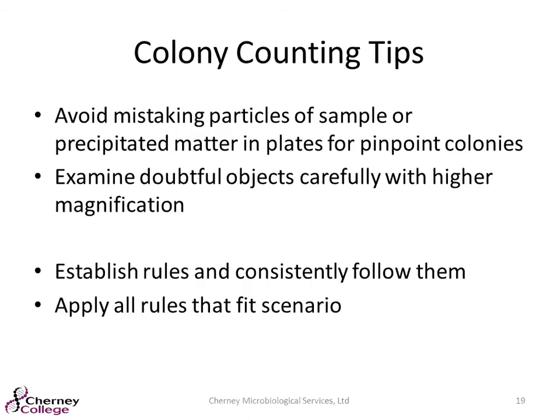I'm going to briefly touch on just some of the basic colony counting rules, basically how to get you to our end result. When you're reading, especially product samples, avoid mistaking particles of sample as colonies. So really use your colony counters or microscope if you need to, or some sort of magnification. And I tell all attendees at Cherney College or whatever kind of class, we follow rules from Standard Methods for dairy and the compendium, but making sure internally you establish your rules and consistently follow them is the key, because not everybody does it the same.